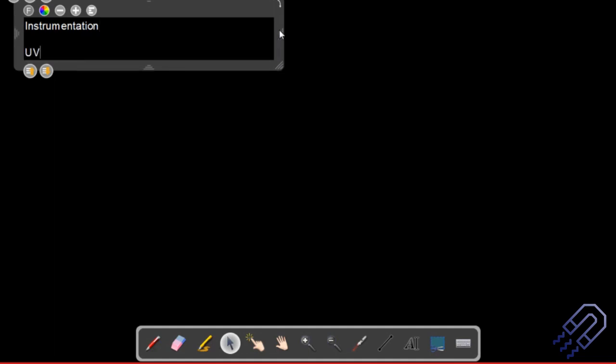And this UV visible spectrometer will most of the time be a single device. It might not have an IR, because sometimes we need higher energy IRs, which may not be incorporated into the system. So this UV visible spectrum, and even the IR spectrum, will basically be recorded by a device having a similar setup.